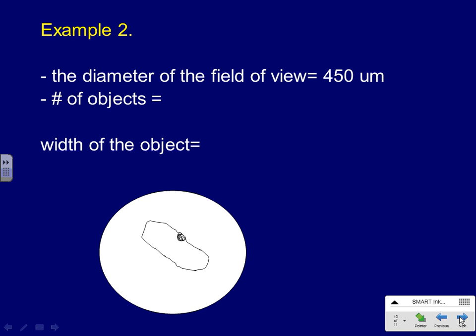So how many would you think? What do you think? And it's truly an estimation. You're staring down the microscope and you're going, yeah, I don't know, 3.5, you think 4? 1, because this counts as 1, right? 2, maybe 3, 4. I like 4 as an estimation. That would be fine. Again, it's an estimation. Can you be wrong on this? I guess you could. If you said 1, I'd say no way, right? If you say 10, I would say, really? You're crazy. If you said 5, yeah, I would be stretching it. I would probably accept it, right? So the estimation can be wrong, but there's like 4.5. Oh, I'd buy 4.5. But we decided on 4, that's fine.